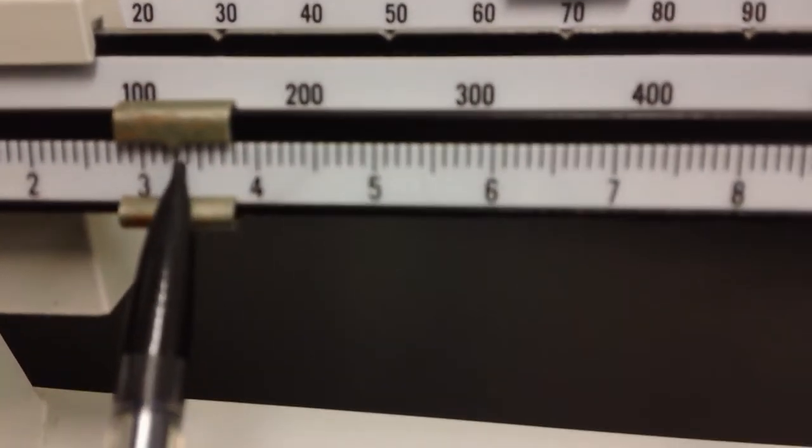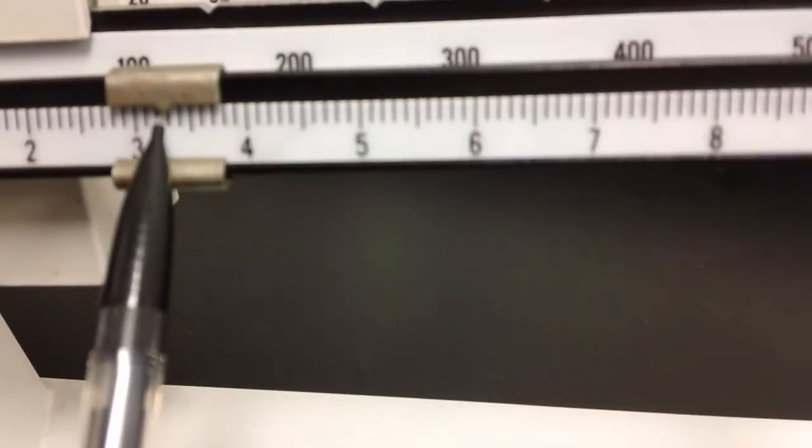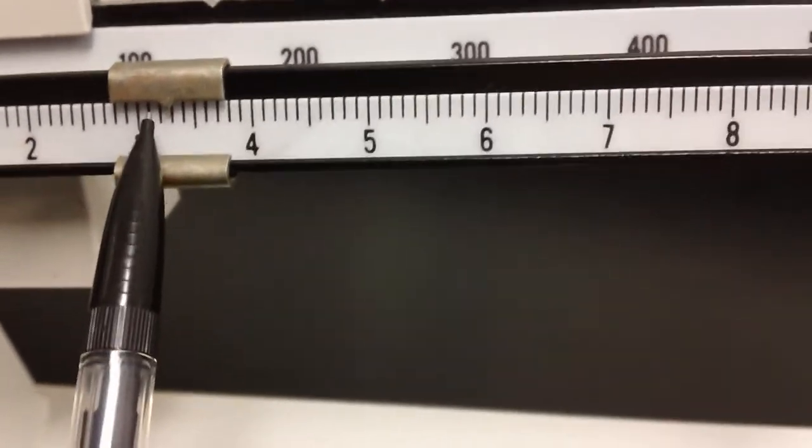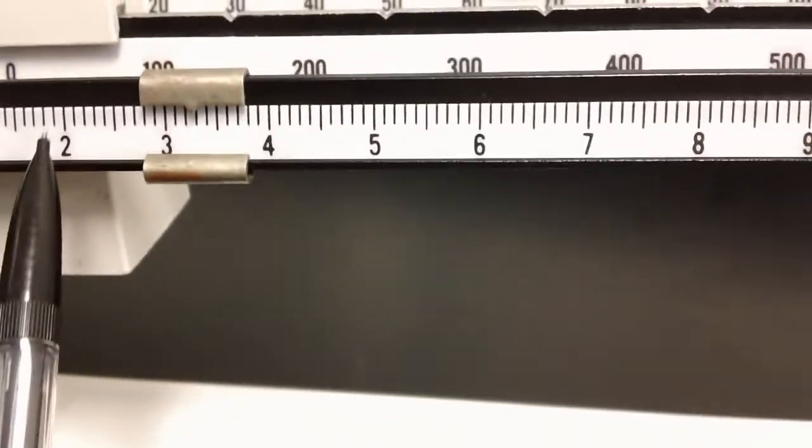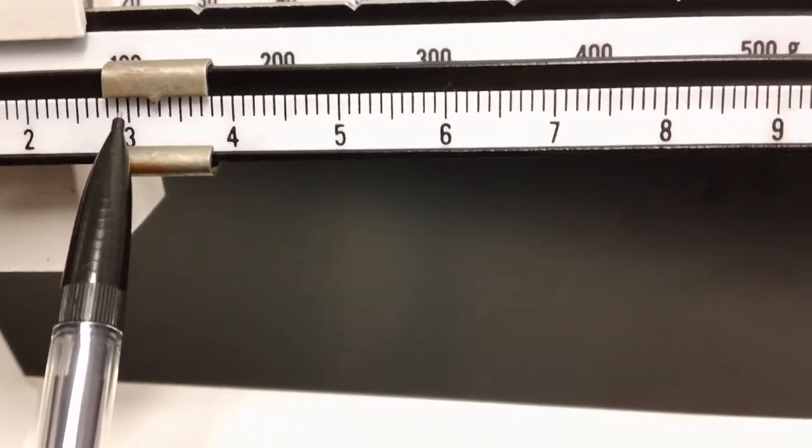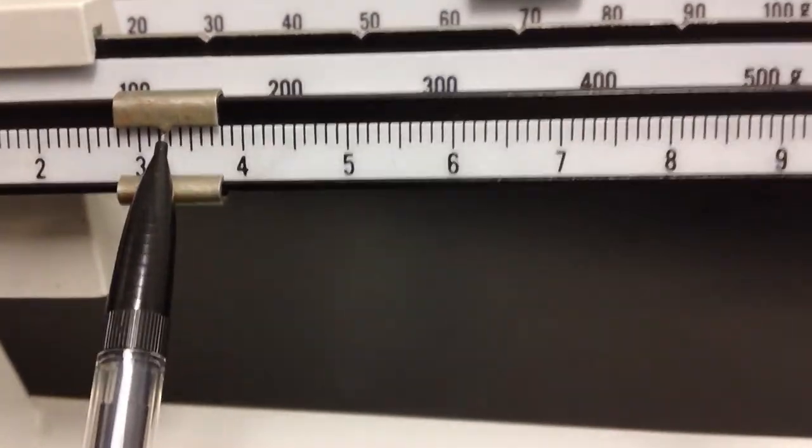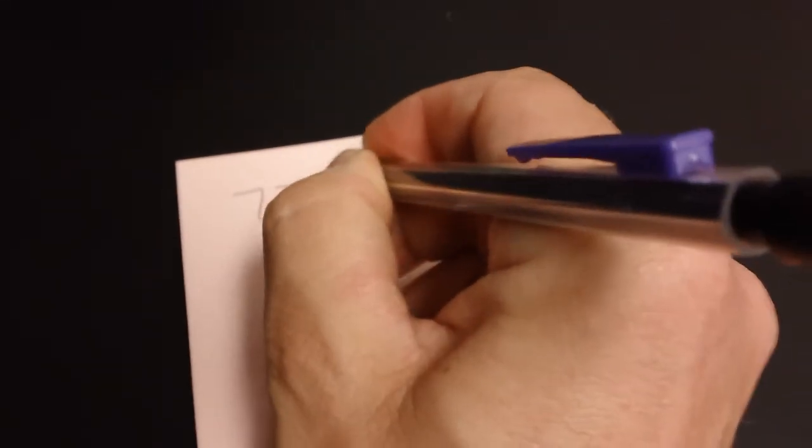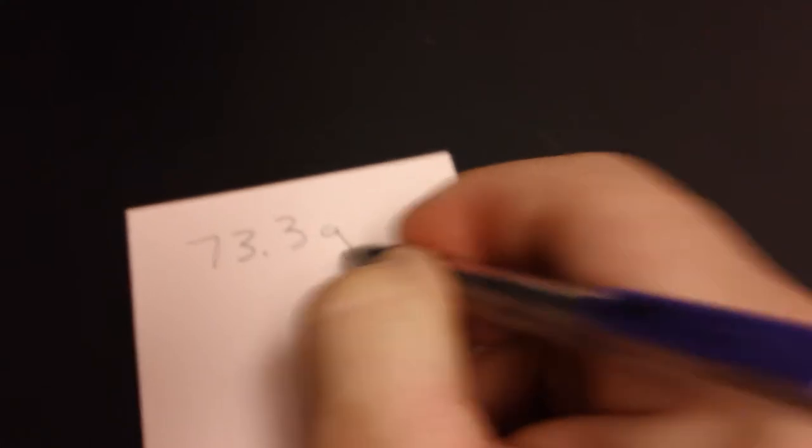So let's add this up. I'm going to take 70 plus 1, 2, 3. And if I'm measuring this, you guys, notice that there's a little tiny arrow right in the middle of this counter mass. So that's 70, 1, 2, 3, 0.123 grams. So we would write that down as 73.3 grams.